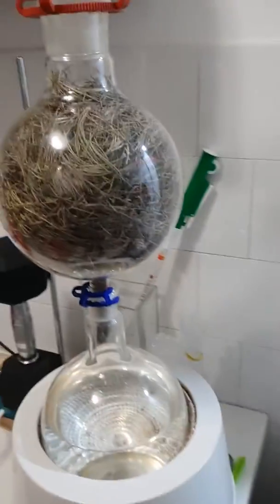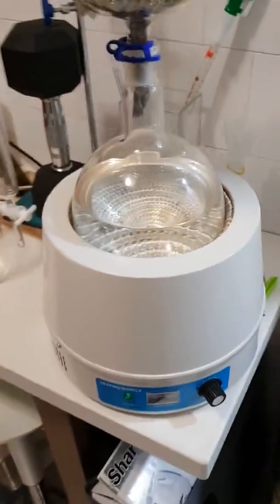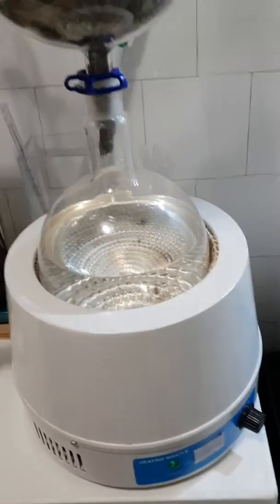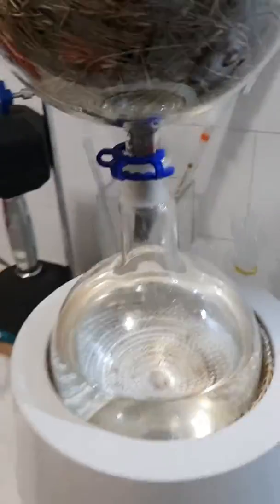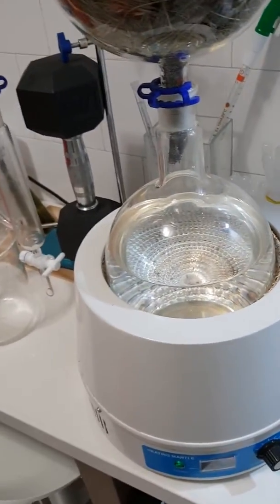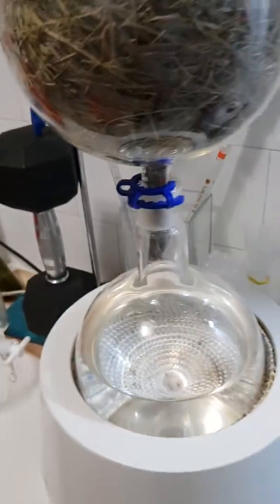Today I'm distilling a pine tree I collected myself in a forest close to Tel Aviv. I have a warming jacket flask for the distillation, and I've mixed the solvent — about half water and half ethanol, which is 99.9% ethanol.